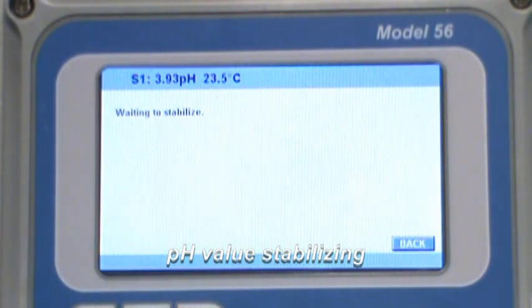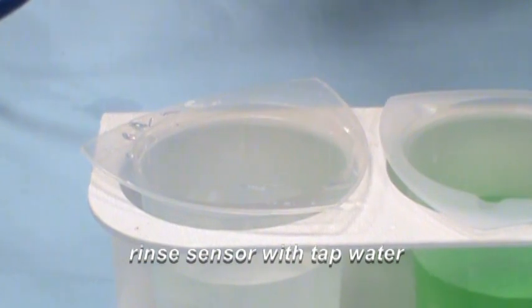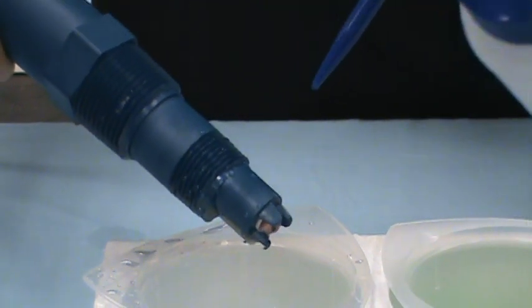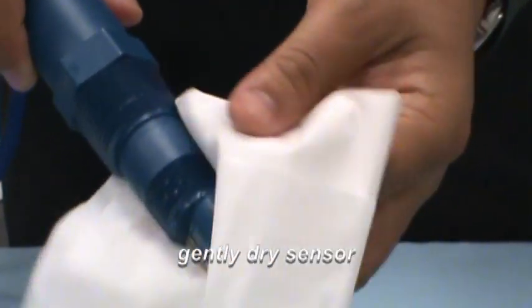Once the buffer value has been acknowledged by the instrument, remove the sensor from the pH 4 buffer solution. Rinse the sensor in the rinse beaker. Pat the sensor dry with a soft cloth or tissue.